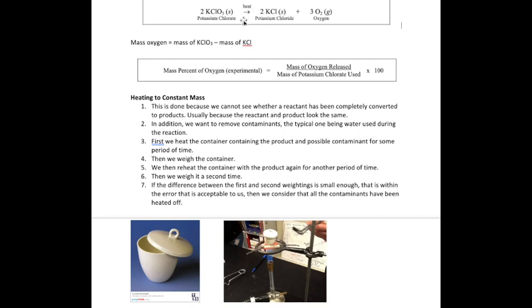Your potassium chlorate reactant and potassium chloride product look the same—both are just white powder. It's very hard to tell that you've converted potassium chlorate to potassium chloride just by looking at it visually. We can't see that we actually have our product, so we have to weigh it. The weighing tells us we have a smaller mass.